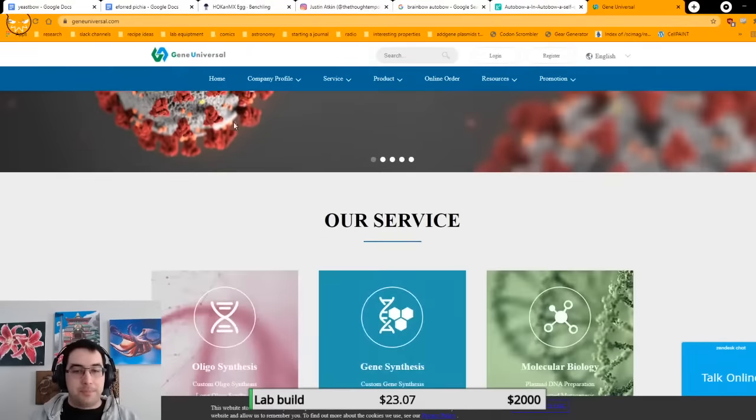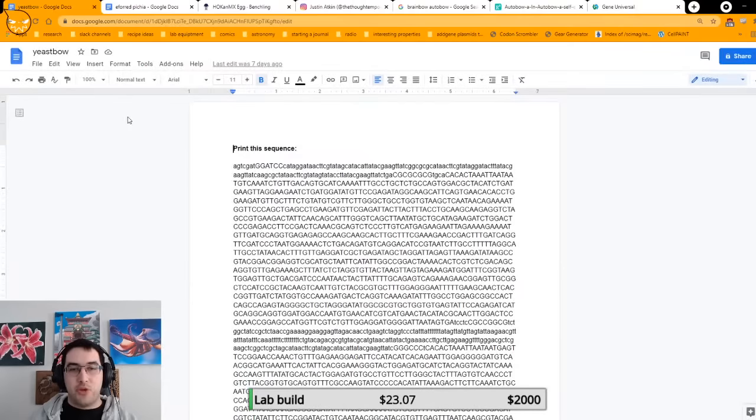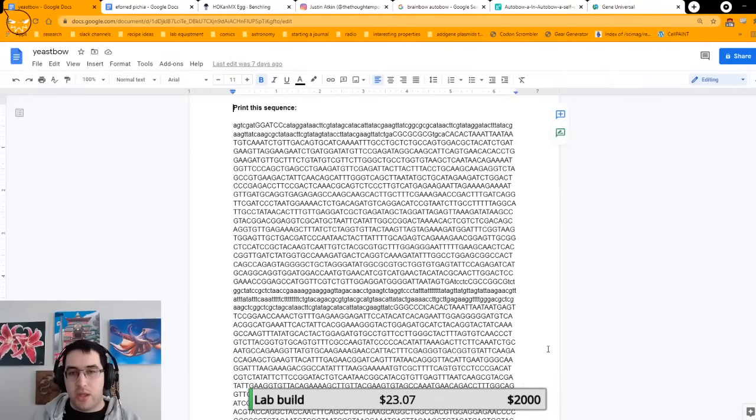However, there are some caveats with working with them. I don't actually know where they're based. I think it might be China. I'm not sure. But the point is, you basically need to tell them exactly what you want to do. They don't have an online tool like Twist where you just submit a thing, because it's an actual person who receives the request, analyzes it, and decides whether or not they can make the thing. So this is the way that I have always written my orders, and it's only ever been a problem once, where there was some weird stuff in the plasmid, and we'll get to that today. Actually, maybe today, we'll see.